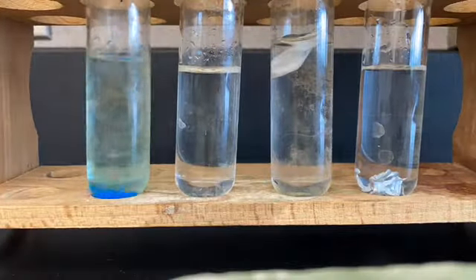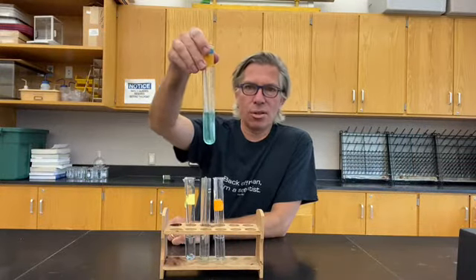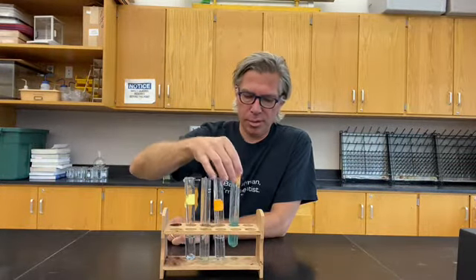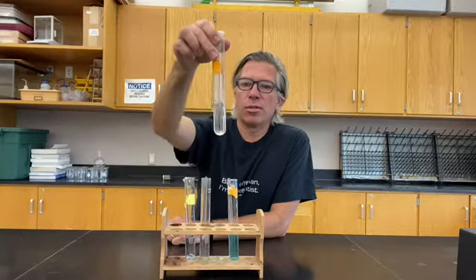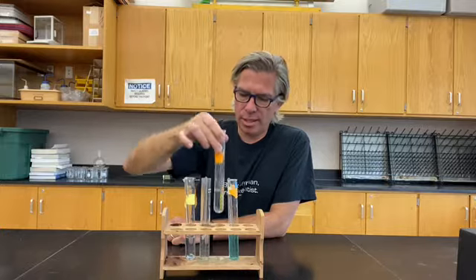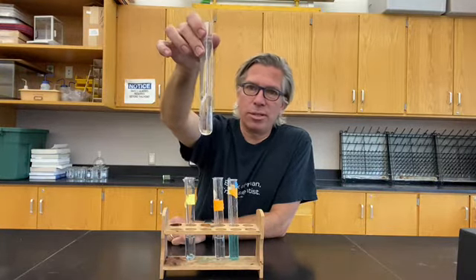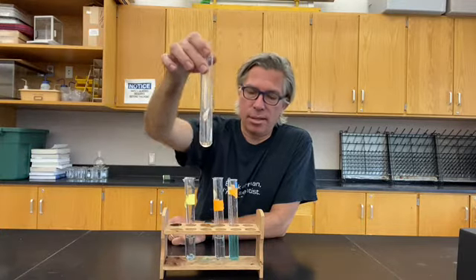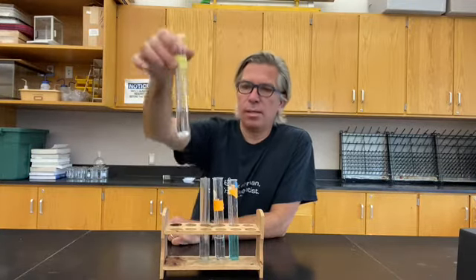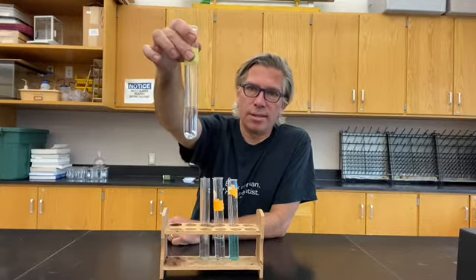Next, we'll try to dissolve a small sample of each in water. And the results are in. Copper sulfate, completely dissolved in the water, turning it a nice blue color. The dextrose also dissolved completely in water. I don't see anything there, and the solution is clear. The paraffin is just still sitting there right on top, hasn't done anything. And the zinc is also sitting there right at the bottom, also hasn't done anything.